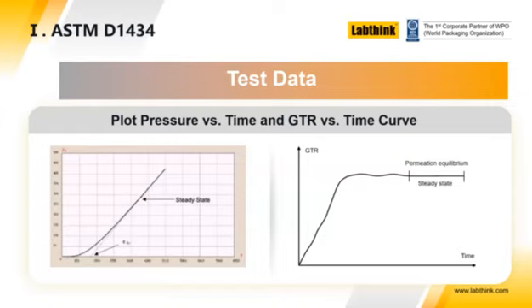And then once the test gas is released into the system, what we're looking at is a change in pressure in the lower cell. So as the gas moves into the evacuated chamber, the pressure therein starts to rise. And so we look at that rise, and when the rate of pressure change is consistent, on the drawing on the left, you can see when the line becomes a straight line, that's when we determine that the system has reached a steady state.